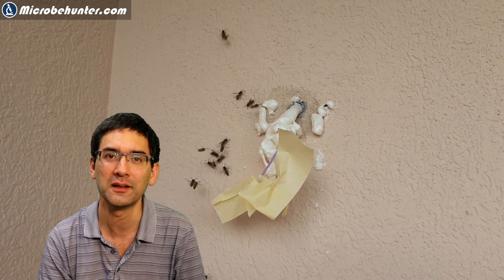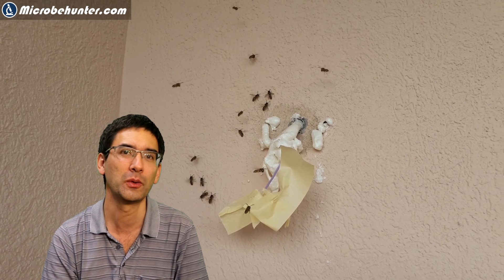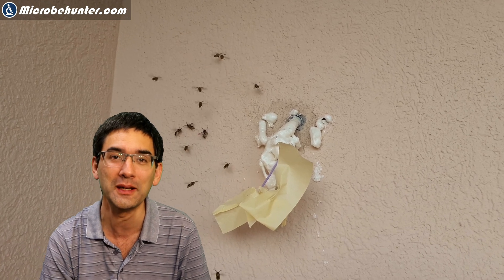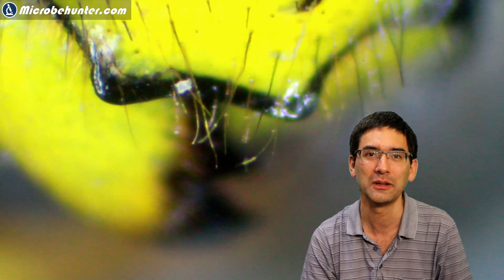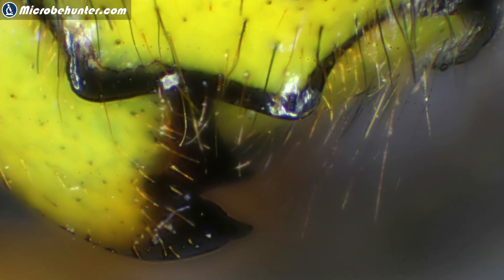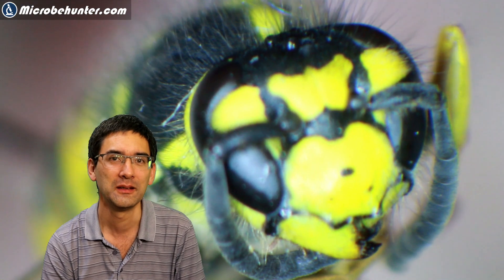Well, this is basically the place where I injected the foam and the wasps tried to gather around it and they were not quite successful in entering their nest. That's a good thing. I did not want to spray any poison, but I think that might be the only possibility. These here are the jaws of the wasp. And here again, I have a stacked image. It looks quite nice here as well. Again, a portrait shot of the wasp.